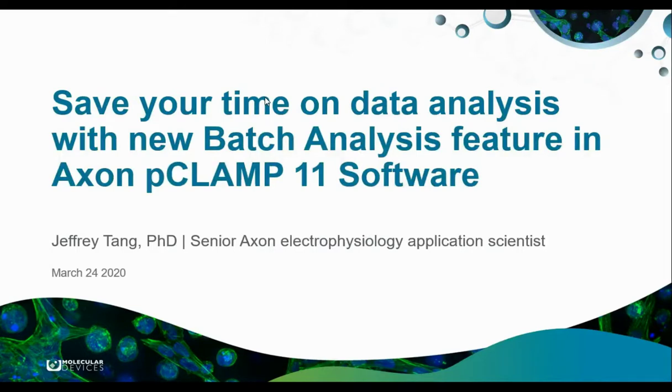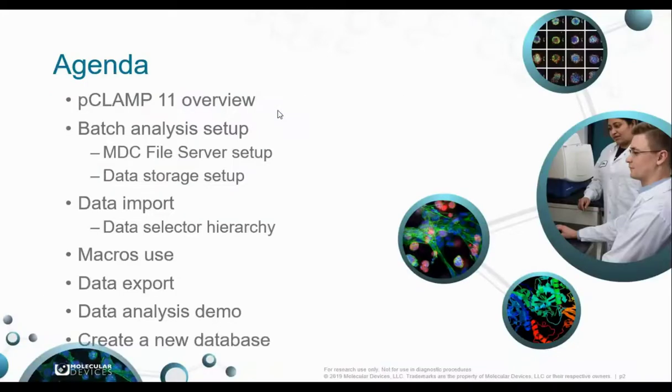Hi, everyone. Thank you for attending this online webinar. My name is Jeffrey Tang, a Senior Application Scientist of the Axon Electrophysiology product line. Today, I'm going to talk about one of our new features in pCLAMP 11 software. This amazing feature is called batch analysis. Using batch analysis will save you a lot of time on data analysis.